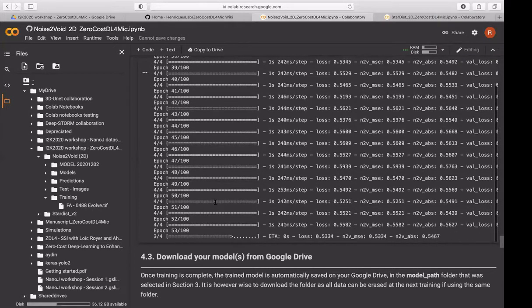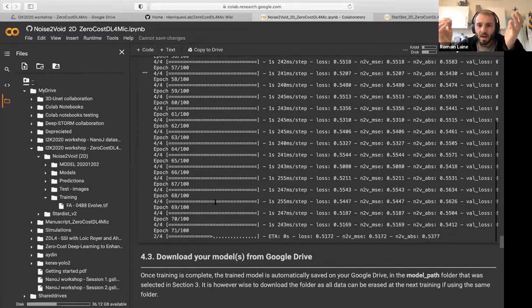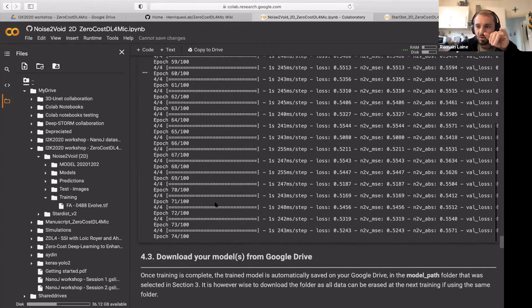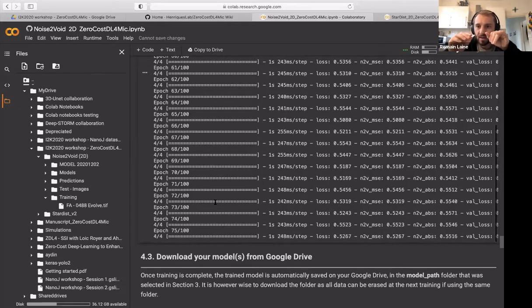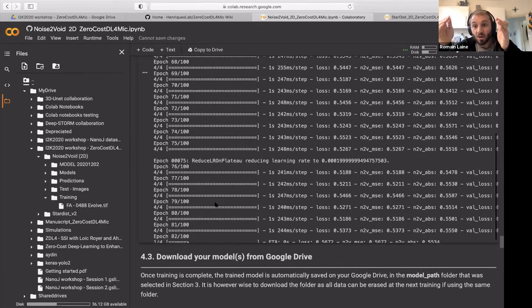Sorry, short question. Maybe I missed it. What exactly is the learning rate, and when does it decide to decrease it? Okay. Yes. Very good point. So you remember from Guillaume's talk, the learning rate was part of that backpropagation algorithm, and the learning rate tunes how big of a change in weights we perform at each step, depending on the error.